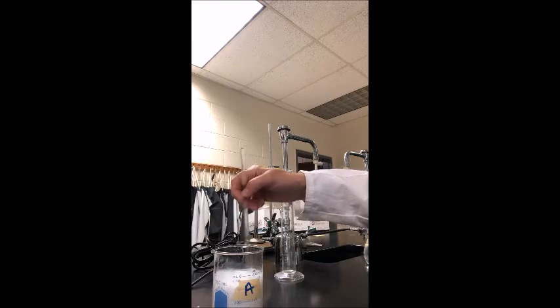And then I have to let it settle before I start filtering. So I'm gonna keep stirring for like 30 seconds. I'm not gonna make you watch that, but just know that I'm stirring here to make sure everything's reacted.